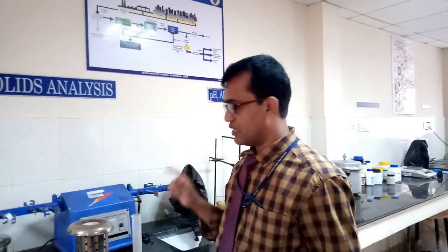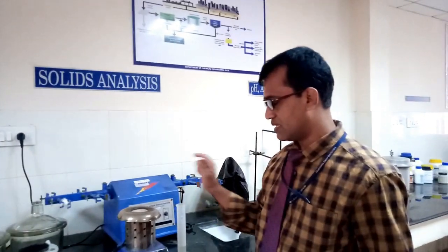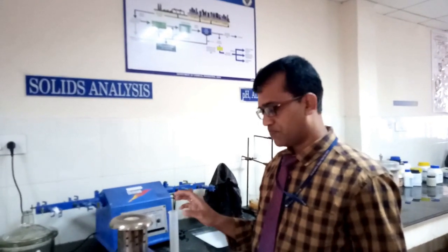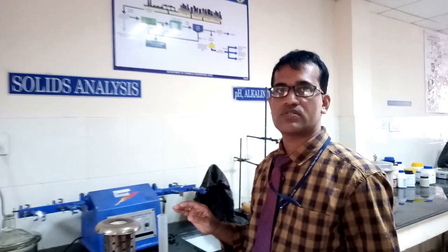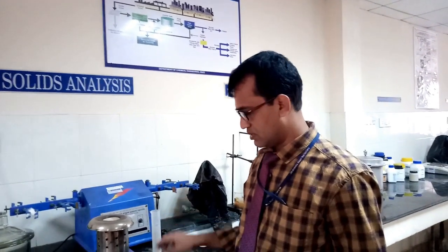Then you will get two weights, the initial weight of the crucible and the final weight of the crucible. This difference gives the total solids and volatile solids present in the sample.